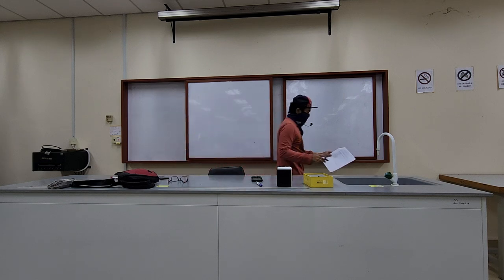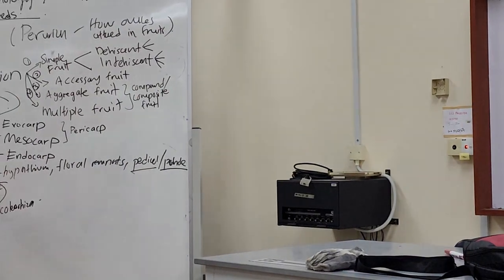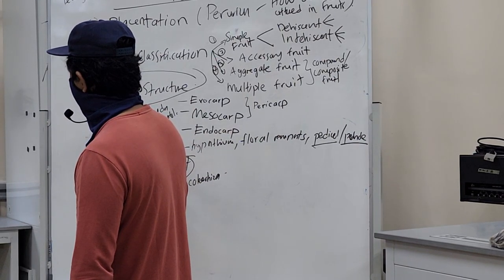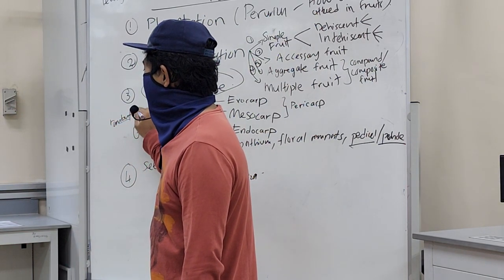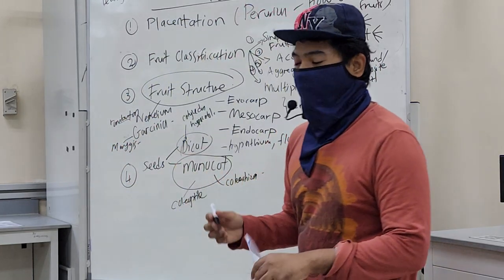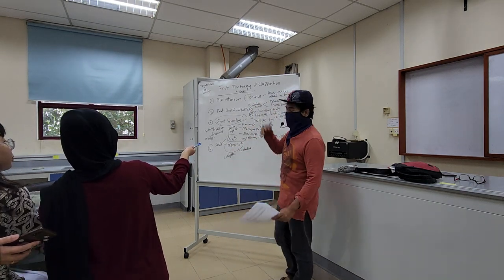To make your life easy, for this fruit structure, maybe you can focus on these two samples, the Nephelium and Garcinia. Nephelium is rambutan. Garcinia is, yes, mangosteen. If you want to go deeper into the structure of it, you can, but to some degree, please make it present.